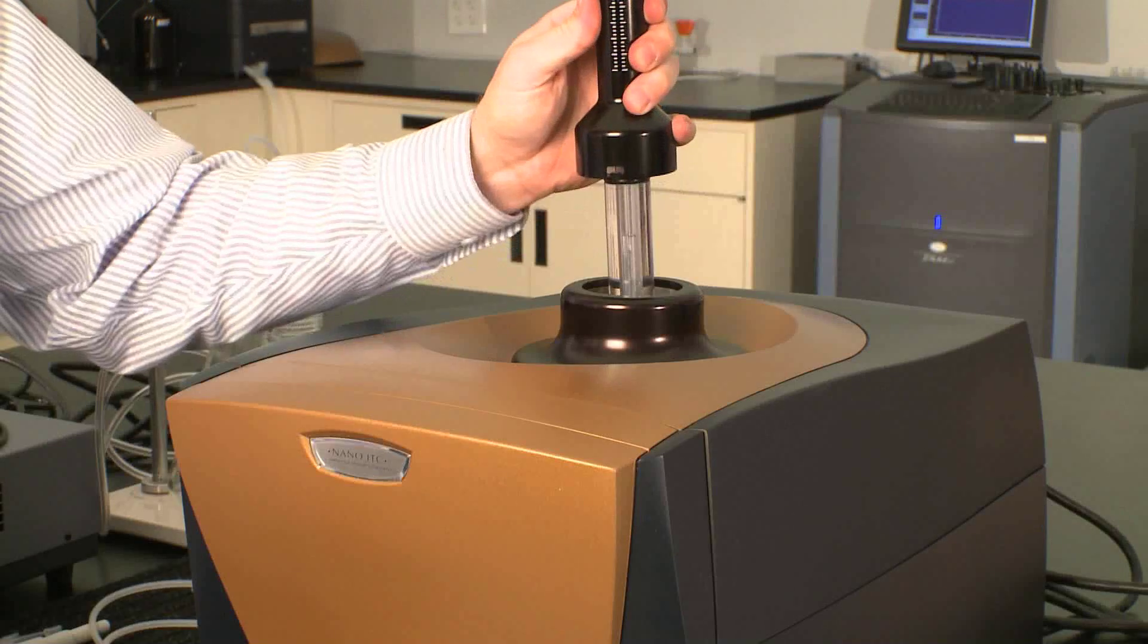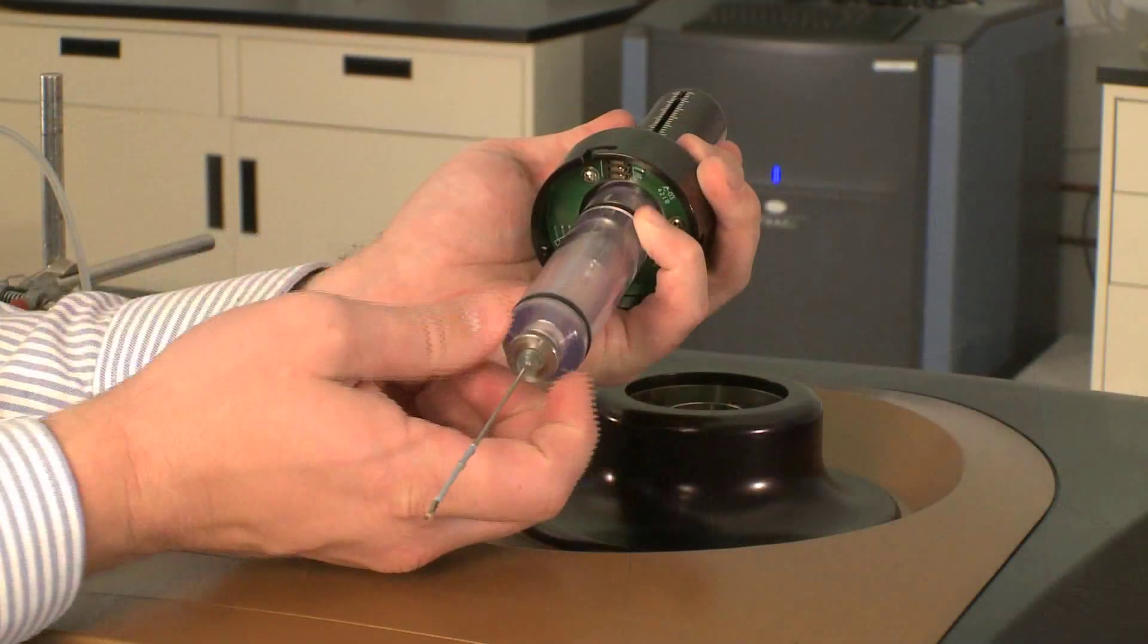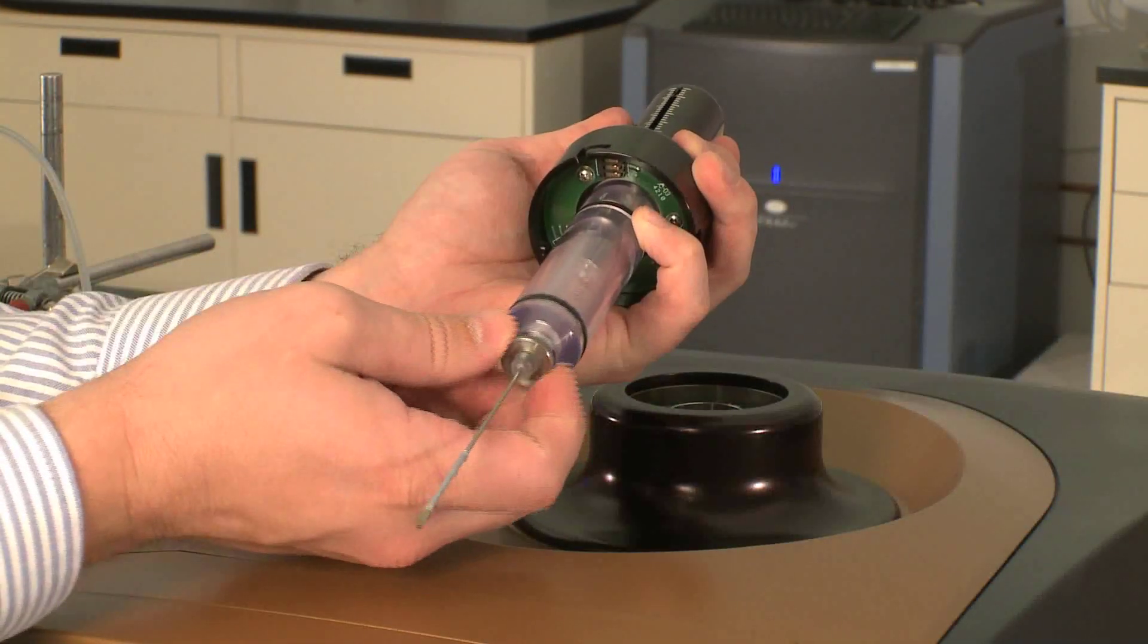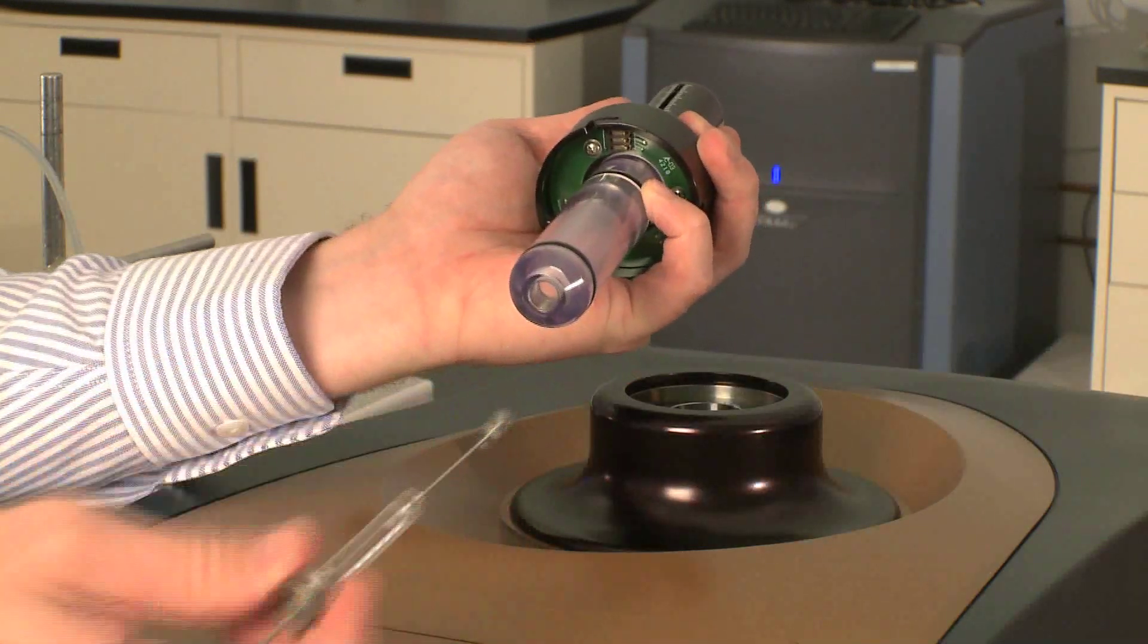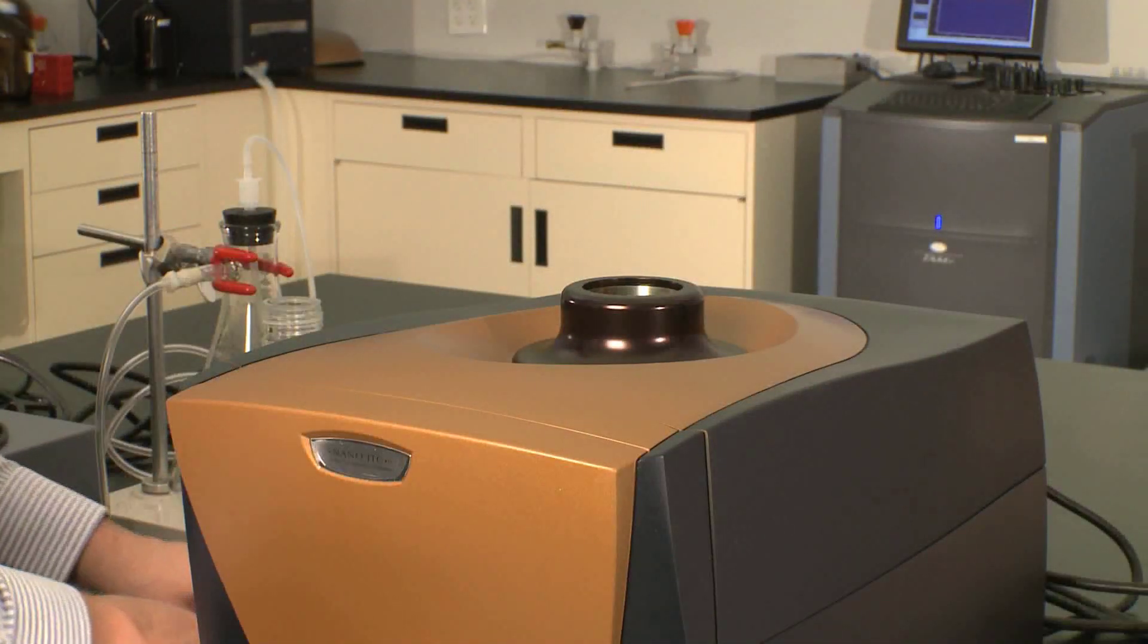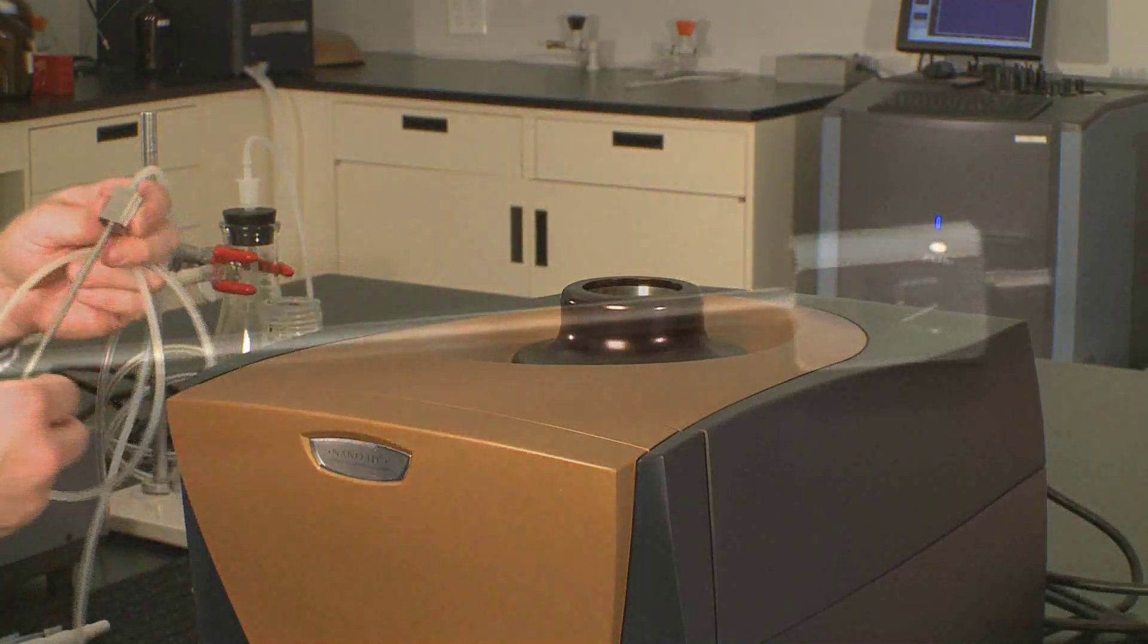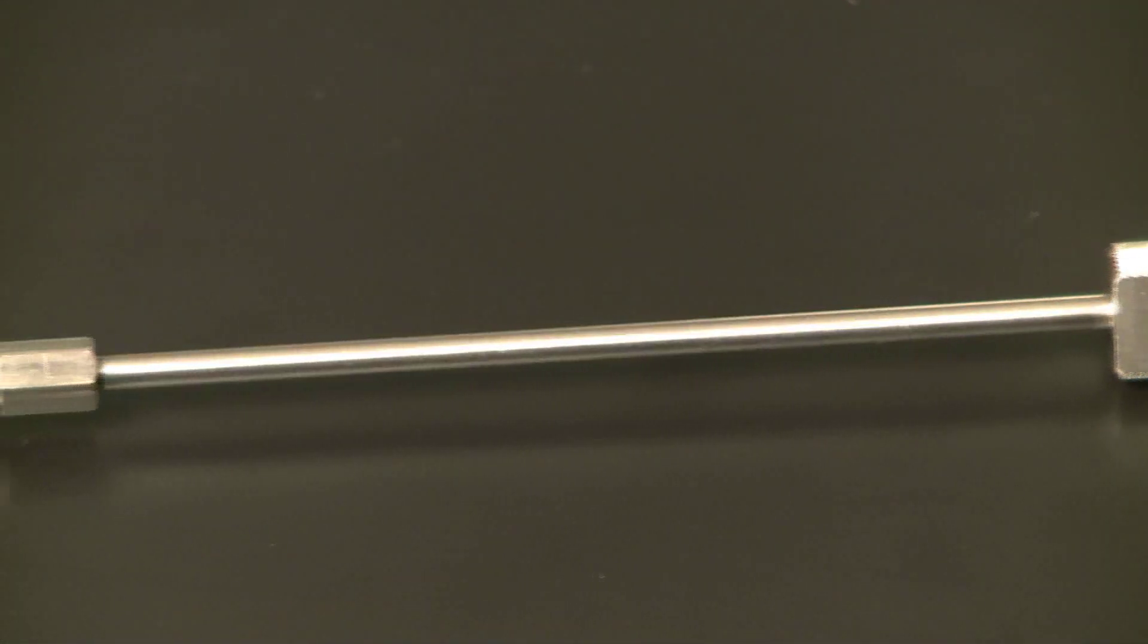First, remove the burette handle and remove your syringe to be cleaned. Then we can use the cleaning tool that's provided with the instrument. This is a low volume instrument, so we have a low volume cleaning tool.